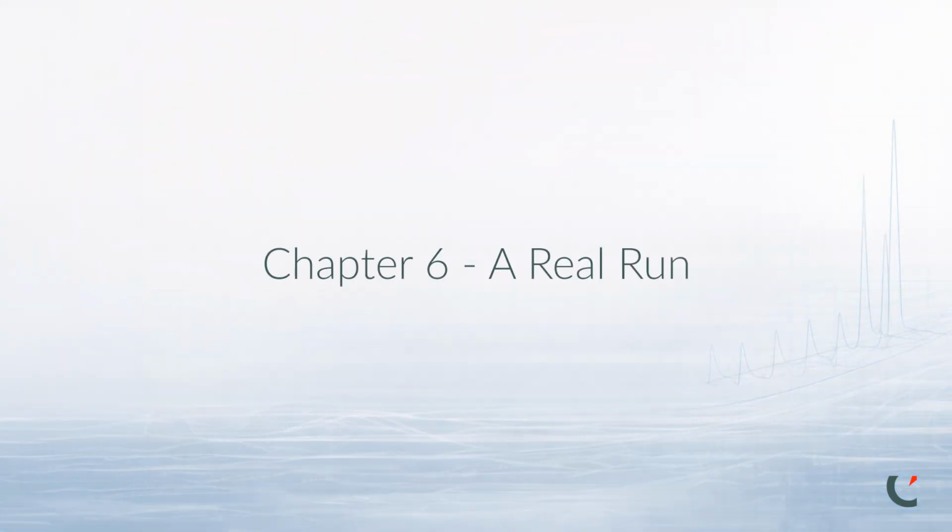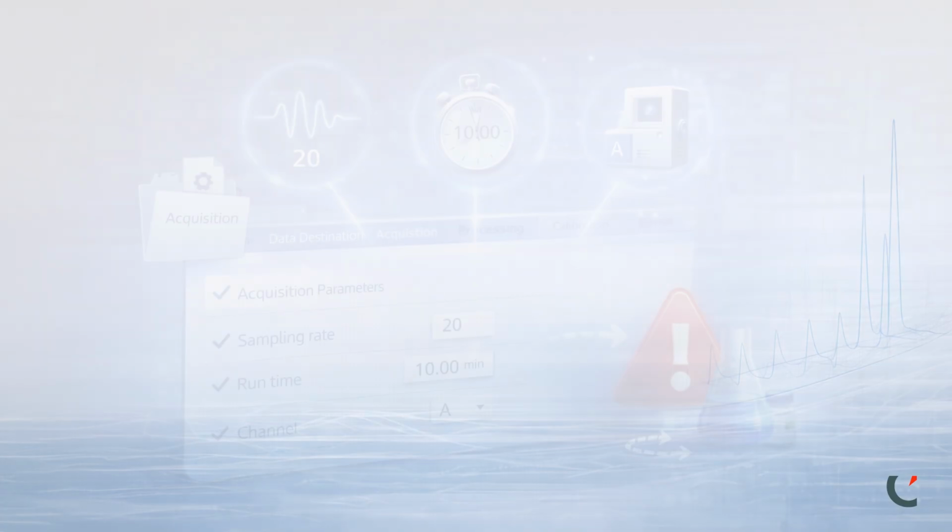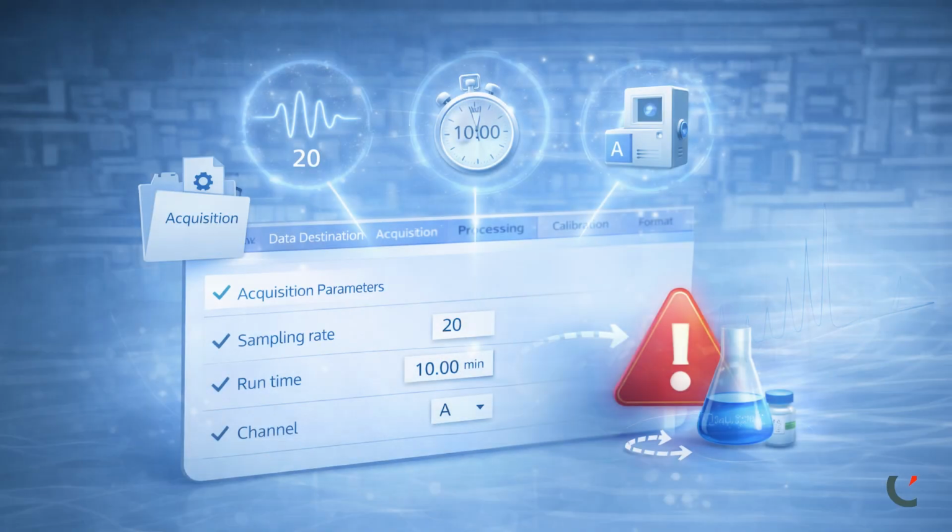This is not a method-building tutorial. It is a controlled application demonstration that ties together the core concepts from Section 2. Before we begin, let's recap an important aspect we covered earlier in this section. Almost all settings within our method have no effect on the integrity of the resulting data files.